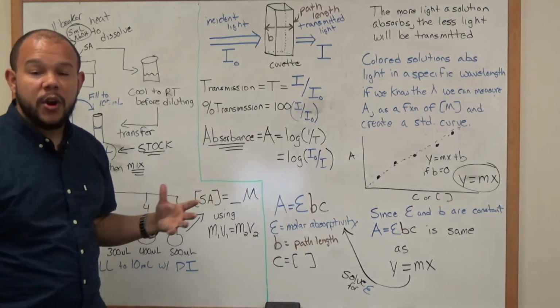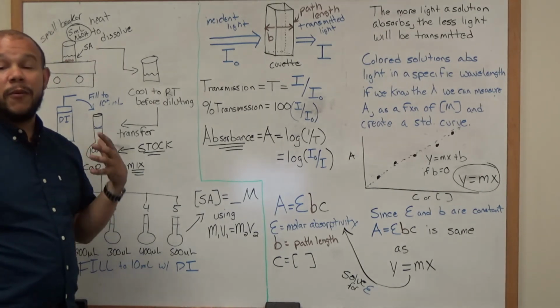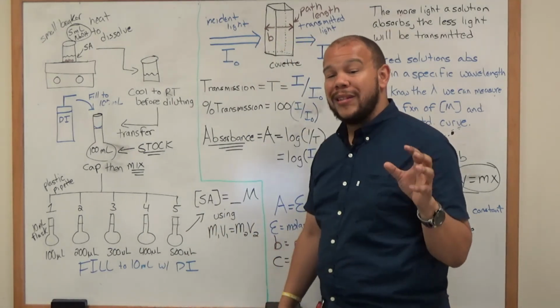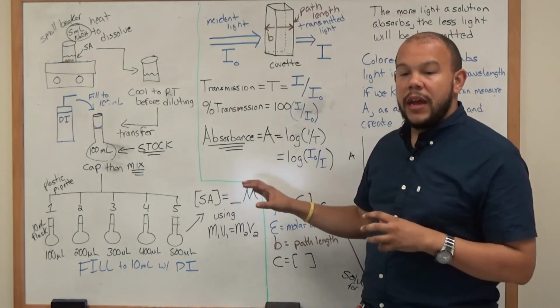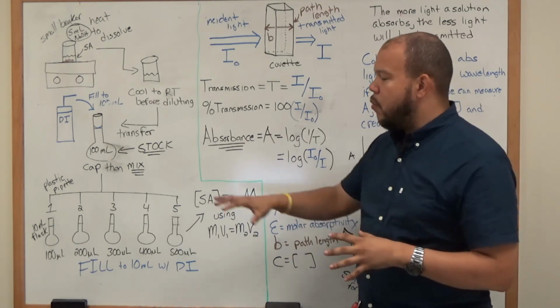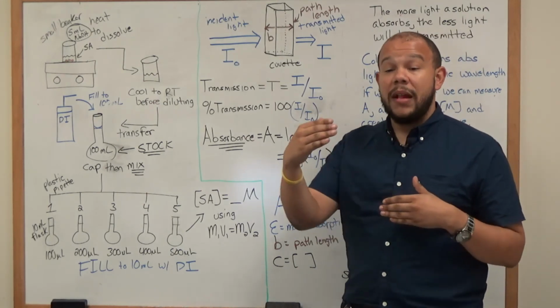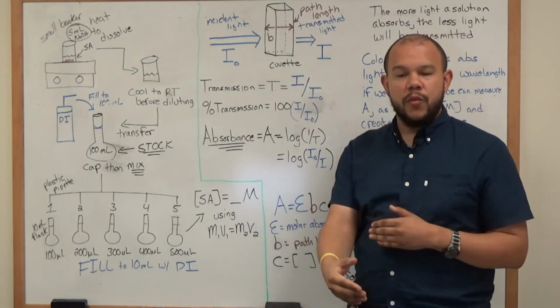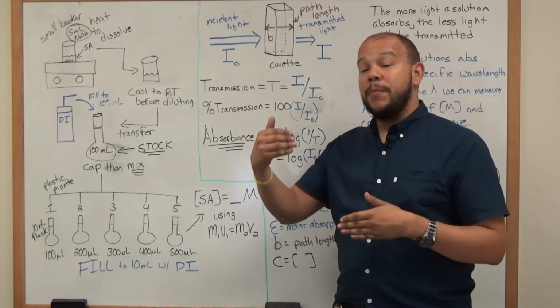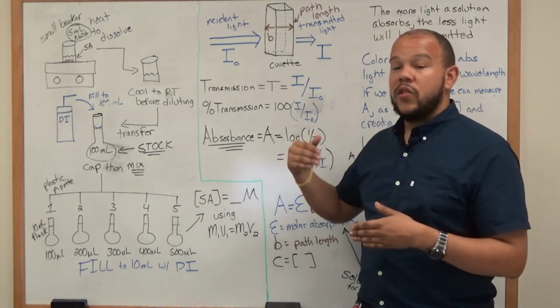But I wanted to just give a quick overview of what we are doing to get people familiar with this. I know this is probably the first quantitative lab that a lot of us are doing, and it's going to involve a lot of work and organization. So I wanted to do a quick recap before you get in the lab. Your instructor will then talk to you about the instrumentation, how to use the instrumentation with the Logger Pro software, and then how to implement that information and that graph in solving for the unknown.